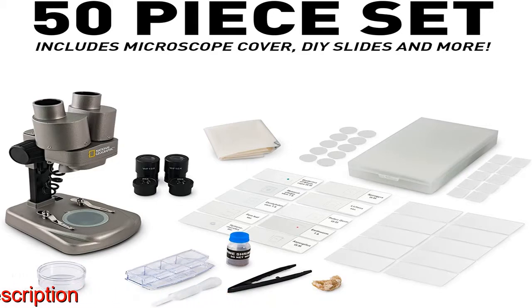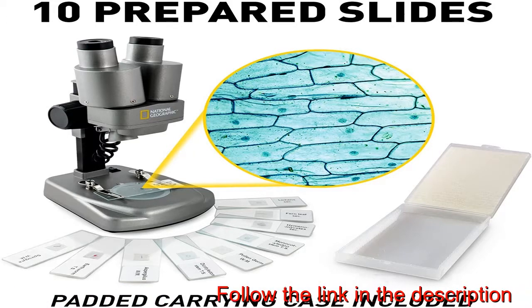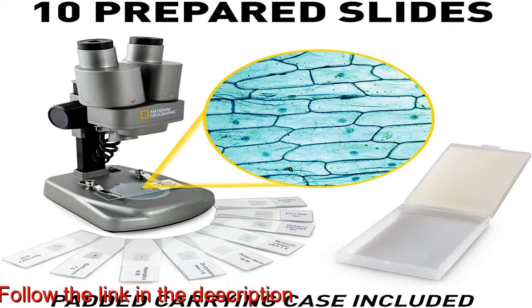Kids science experiments have never been so fun. Brine shrimp experiment included — track the life cycle of brine shrimp with the complete included experiment. Includes hatchery station, shrimp eggs, petri dish, and lab management.